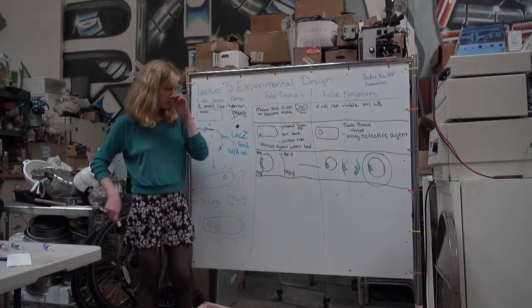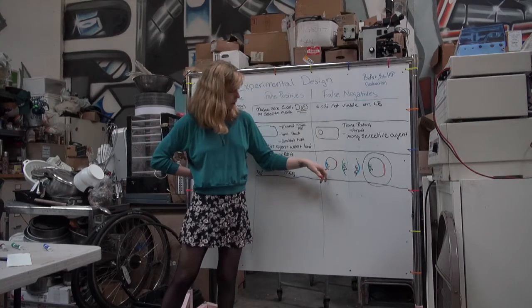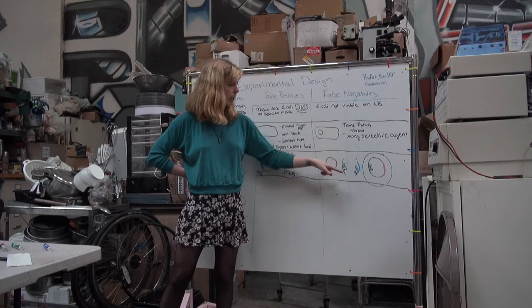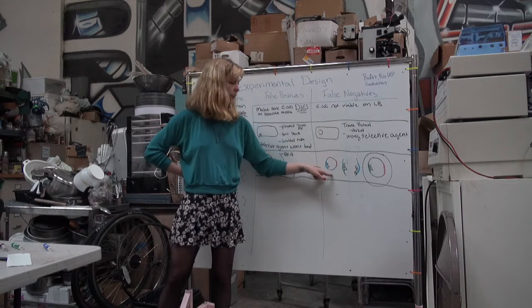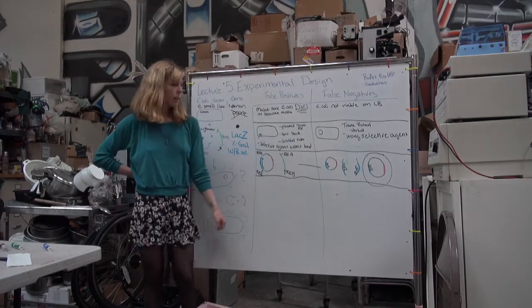So what you typically do is you have your cut plasmid, and you're going to mix it with your gene of interest. These sticky ends are going to attach to each other. You're going to add another enzyme to get your final product.